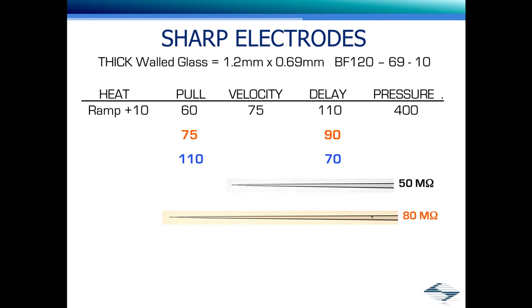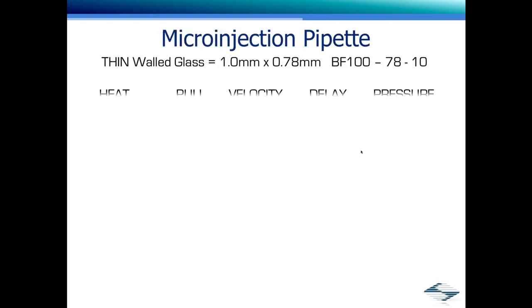I can go even further, but I want to make small adjustments gradually. I want to make one change at a time. I do not want to make this change at the same time as I make this change, because what's going to happen, I'm going to get lost, and I'm not going to know what change was a good one and what was a bad one.